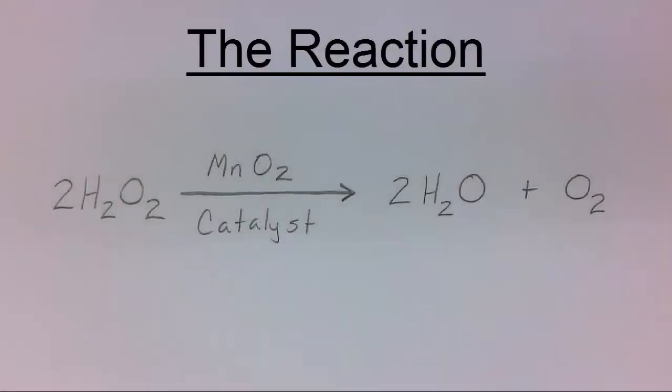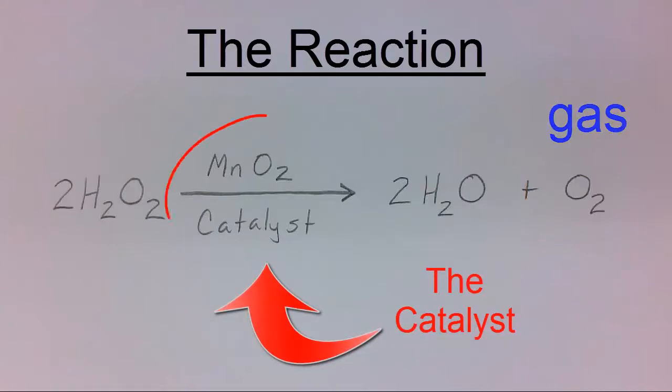The reaction is hydrogen peroxide makes water and oxygen gas, and the catalyst manganese dioxide is written over the arrow.